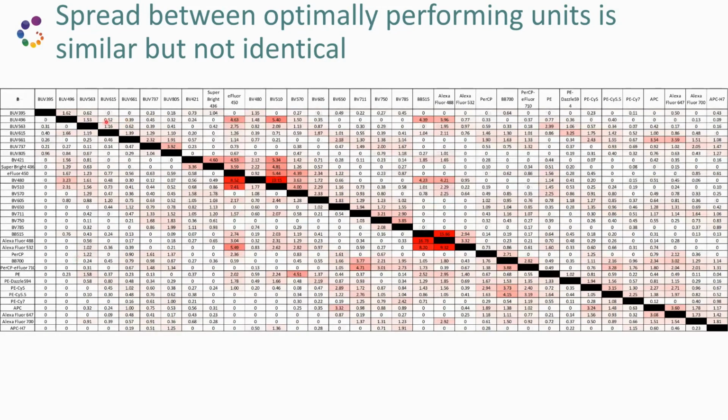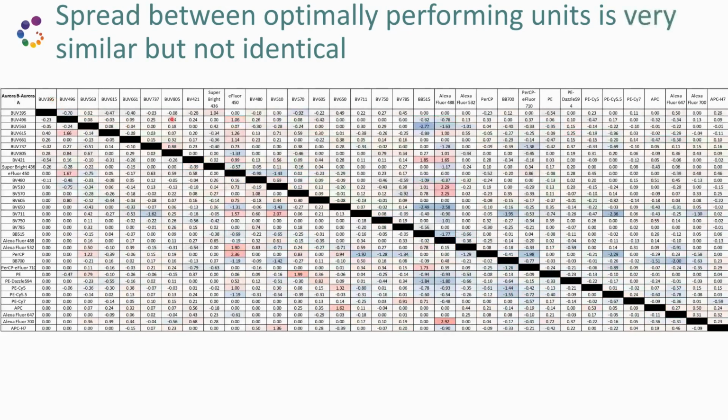So then what we do when we're comparing spread is we subtract one matrix from the other. And this is what happened when we subtract them. It is color coded. Blue is when the number is higher on the instrument we're subtracting from, in this case Aurora A, and pink is if there's more spread from the first item in the subtraction, so Aurora B. And you're going to see that there are areas where there is more pink, there are areas where there is more blue. Even if you are like, oh my God, what does she want us to look at? Every number here is below 3.